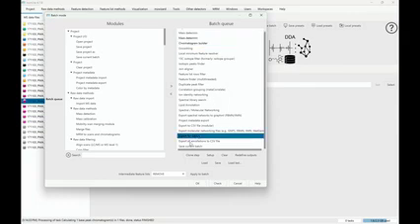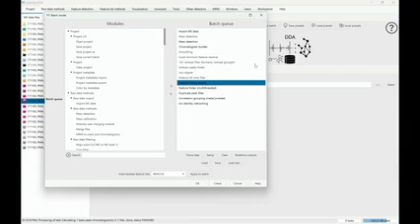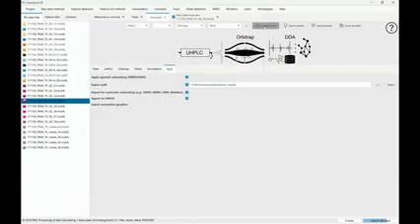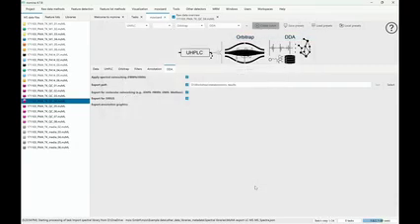export steps. If you don't like some of them, you can just go and delete them, right? You hit the delete key and they're gone. You can reorder them. You can set different parameters, but in general, the idea is you create the batch, and from here you should be okay to just click OK, and it's going to run the batch.